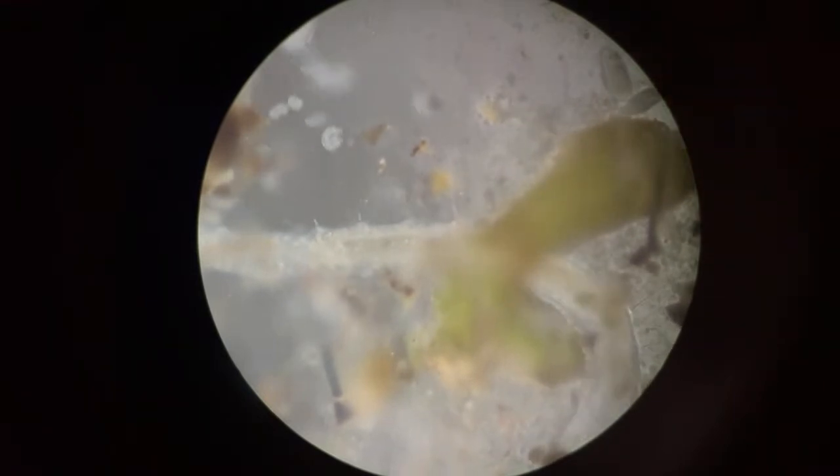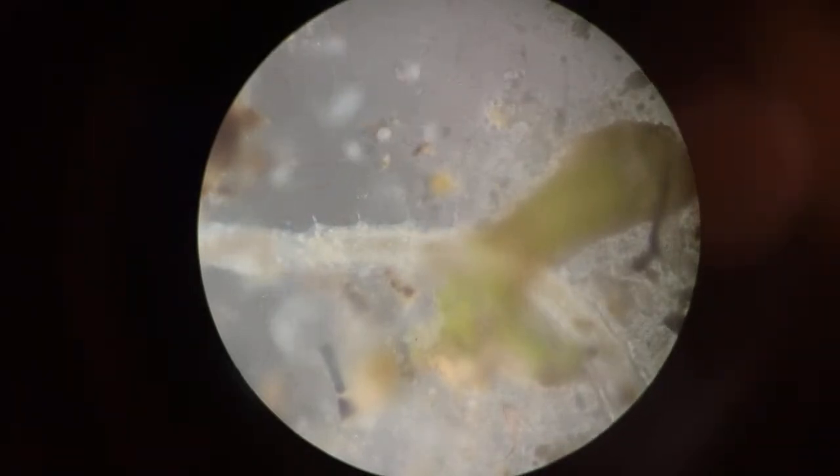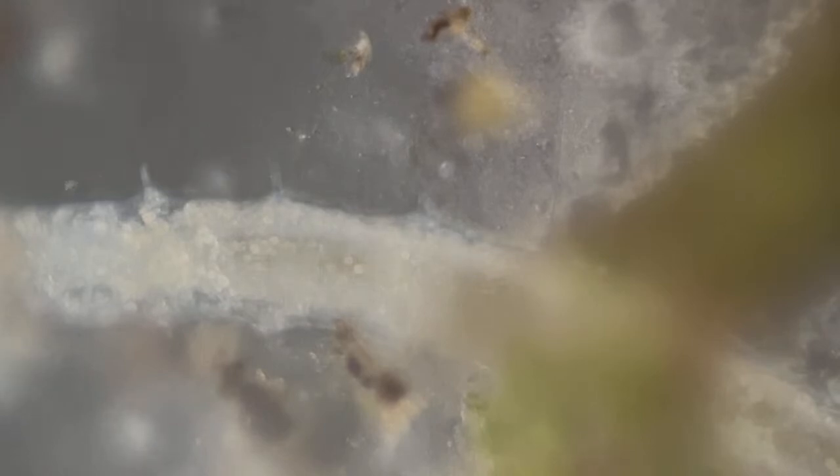I'll need to draw those curtains also. There are 3 curtains in this room which are creating these reflections on the lens and forming a part of the image, distorting the shape. Okay, now we'll just zoom in on this. See the eggs? I believe them to be the eggs. You realize the peristaltic motion in the body.